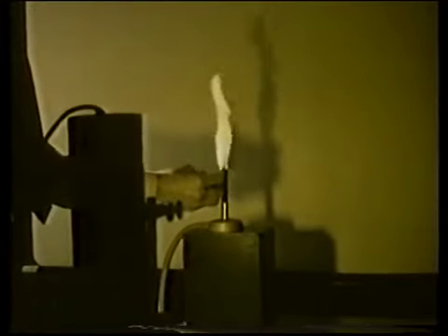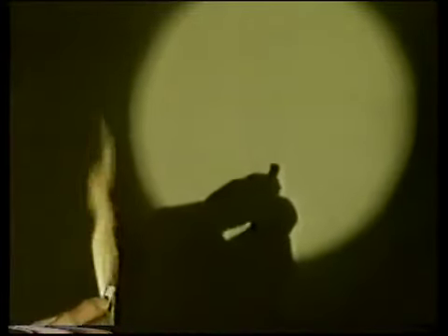Let's put the sodium pencil into the flame and see what we get on the screen. Just like the mercury atoms, the sodium atoms in the flame are casting a shadow. They're absorbing light from the sodium lamp. Now let's see what effect the sodium atoms have on white light. Apparently none. At least there's no shadow. But is that misleading us? Let's examine the spectrum of white light after it has passed through the flame.